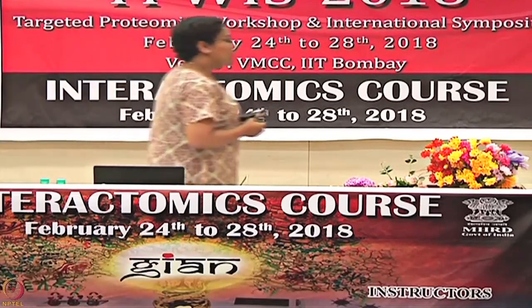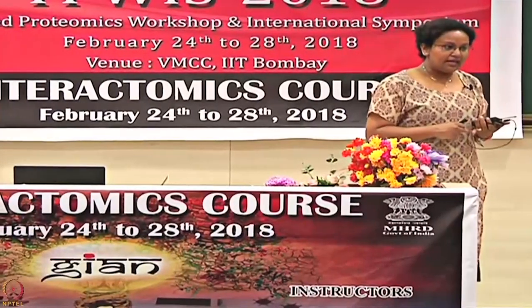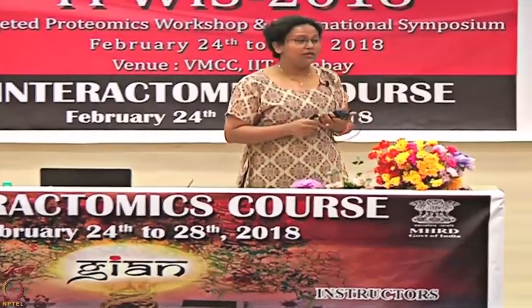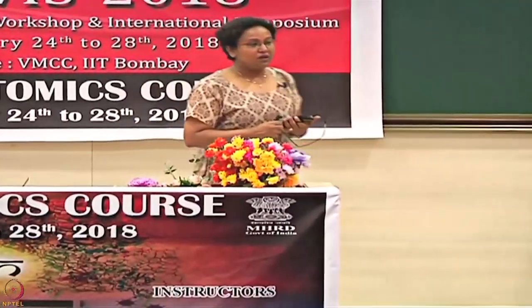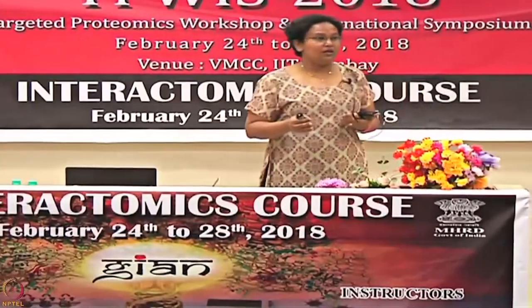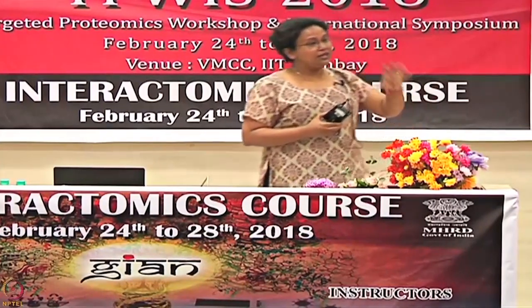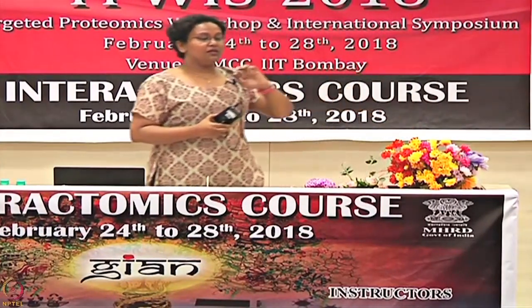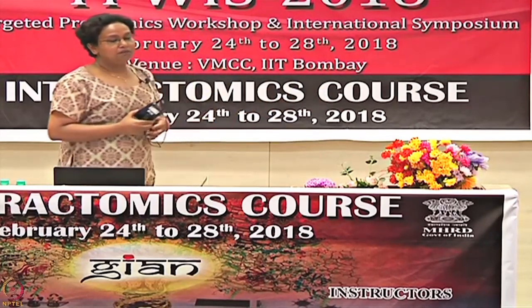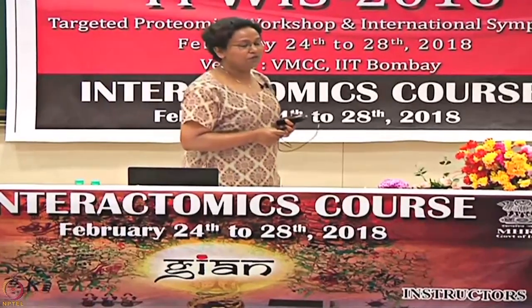If you're doing a kinetic analysis, even 100 RUs is quite high sometimes. Sometimes you have to go as low as 50 or 20, or the T200 actually allows you to work as low as 5 RUs of R max. You can still get a very decent graph without noise, which we can perfectly evaluate and get a KD value from.